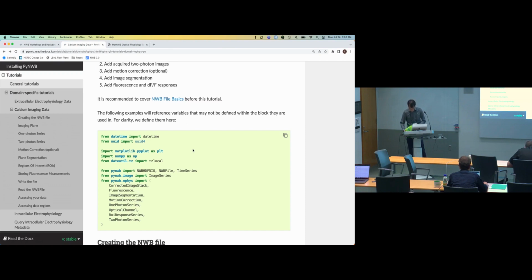What I would probably recommend is, on every custom column, on every table in NWB, there is a description. I would highly annotate that description, describing that process, so someone looking at the file for the first time would be able to understand what it means.